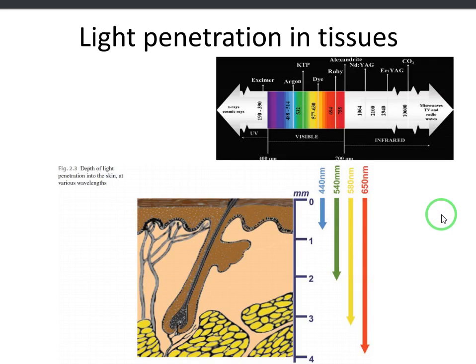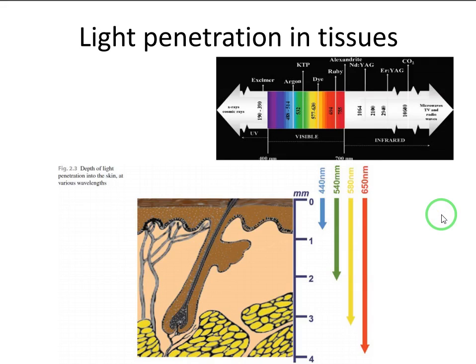Hi everybody, in this series of videos we want to talk about different imaging techniques which are used in the field of biology and nanomedicine. We start with fluorescence microscopy, which uses fluorophores. The fluorophores are excited by light at some specific wavelengths, and then in response they will emit light at longer wavelengths with lower energy.